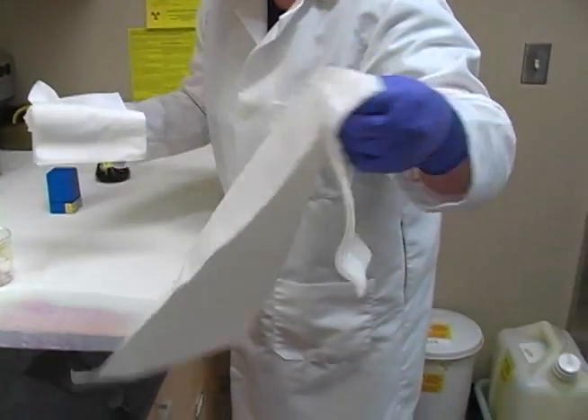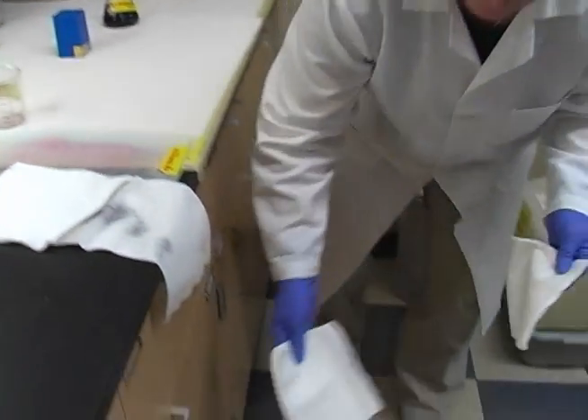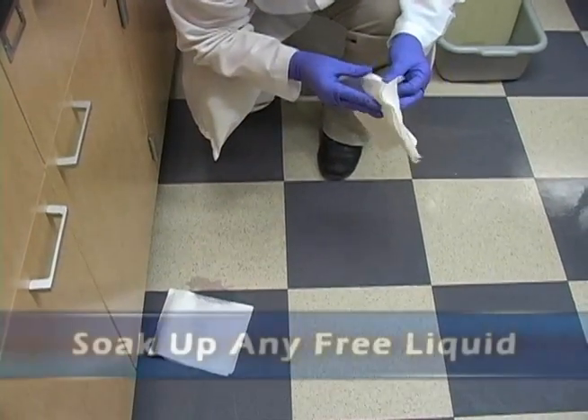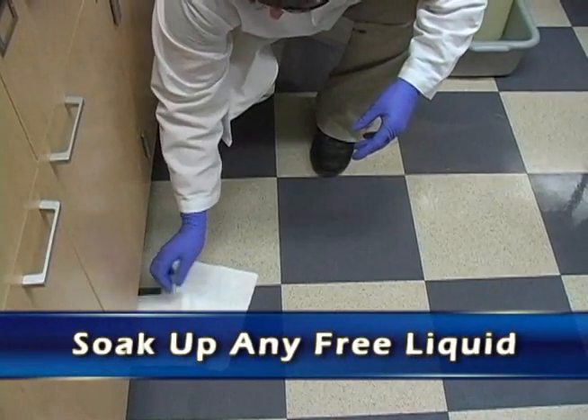Then you need to soak up any freestanding liquid right away so it doesn't have a chance to soak in and cause a more difficult problem for cleaning up. So we're putting paper towels down to clean and soak it up.